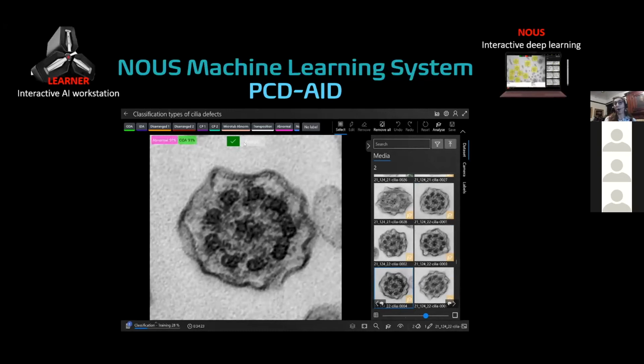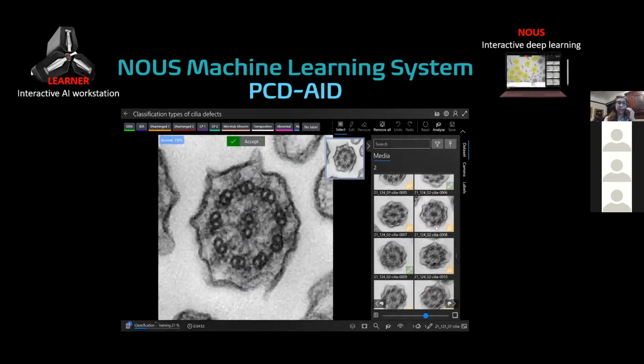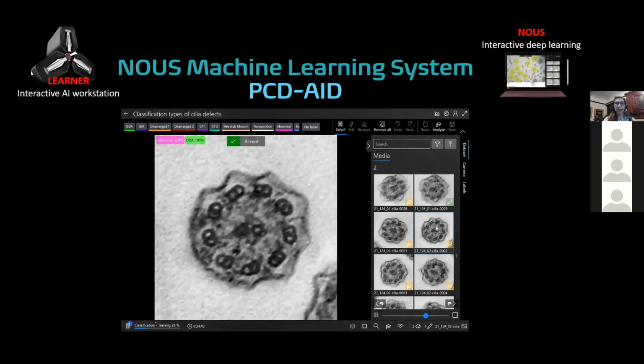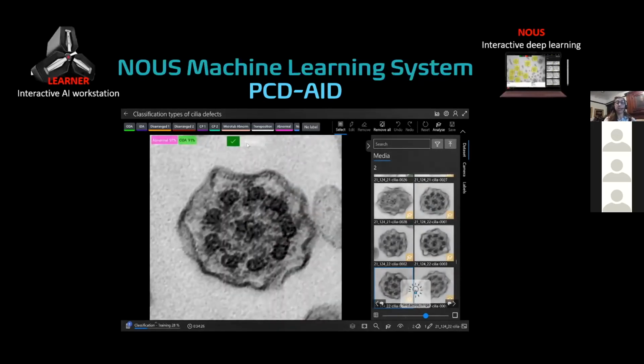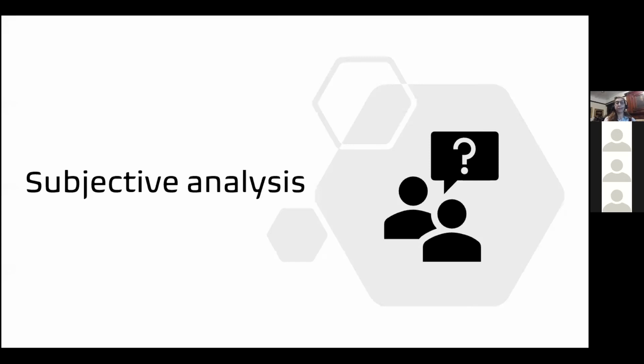So this is obviously something that can be overcome. I'm going to tell you why, but I can disclose it's with numbers. We just need loads of cilia, and more of the cilia that are trouble cilia, which are those that have defects that vary a lot inside their category of defect. Okay, so as I already said a little bit, and this is where it comes from, it's a bit of a subjective analysis.